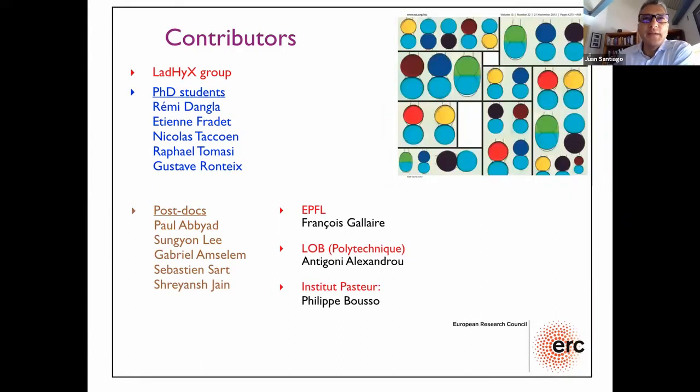Charles, I'm guessing after the oil drains, can you make it so that the water droplet conforms to at least part of the solid surface to avoid optical aberration, because of the index of refraction difference between? So the droplet shape is purely determined by its volume and the shape of the anchor. So if you make the anchor small enough, then the droplet will be squeezed against the bottom, and there you don't have any optical aberration.